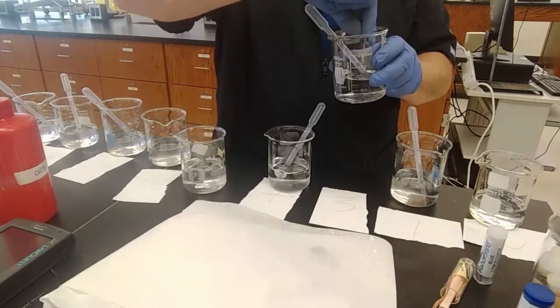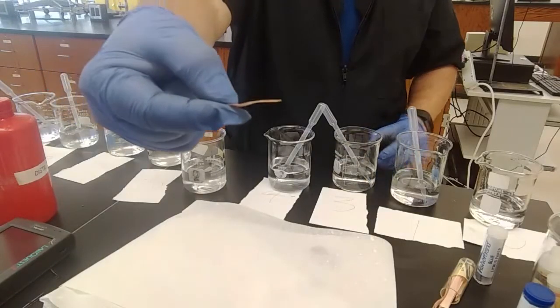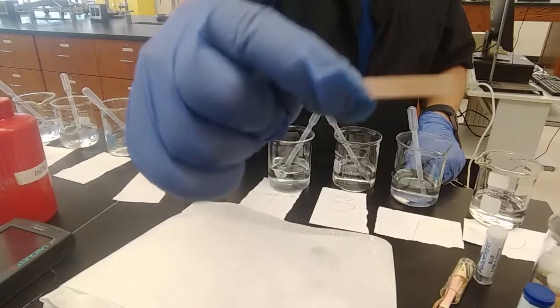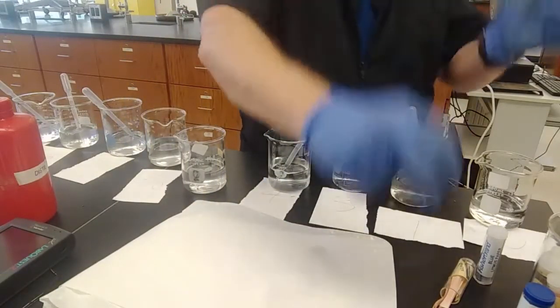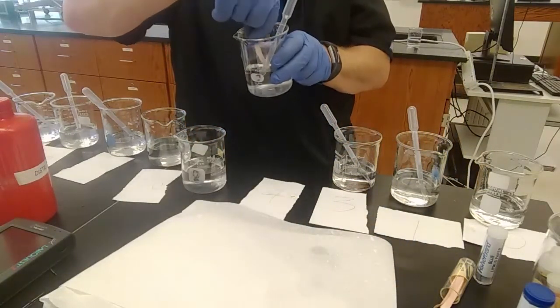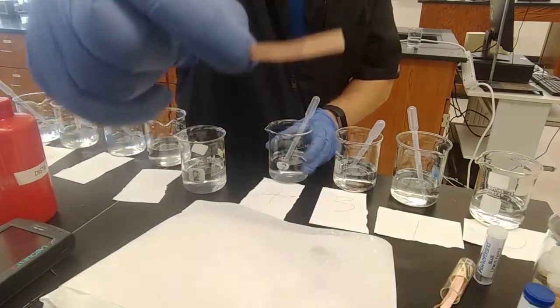I'm going to go for the 3. Dipping it in. I could use a dropper to get a drop onto the paper, but this is just for speed. 3. No change, as expected for the red litmus paper, because we are expecting acid there. 4. No change, as expected.